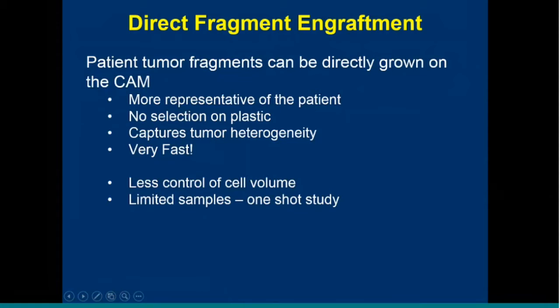A second limitation of the study is that it's truly a one-shot study. We have limited samples. The patient comes in for the nephrectomy. We get the patient's fragments. We have to engraft them immediately, and everything needs to be done within that almost 2 week time frame. So there's no going back. Everything has to be done immediately.